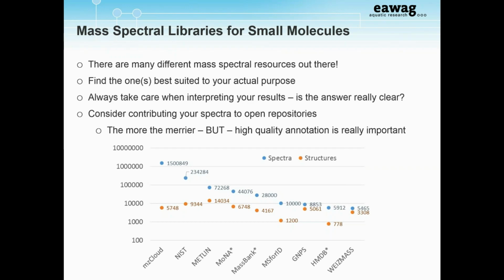Well, again, this depends on the situation, but you can tell, for instance, in MassBank, just by looking at some of the Orbitrap spectra that they've really just copied exactly what comes out of Excalibur. They've got all the noise in there. You can see little trees. You can see some peaks coming above the mass that you've actually acquired the spectrum at, so you've basically got electronic and instrument noise in there. And the same applies to a lot of the TOF spectra that have a lot of background as well.